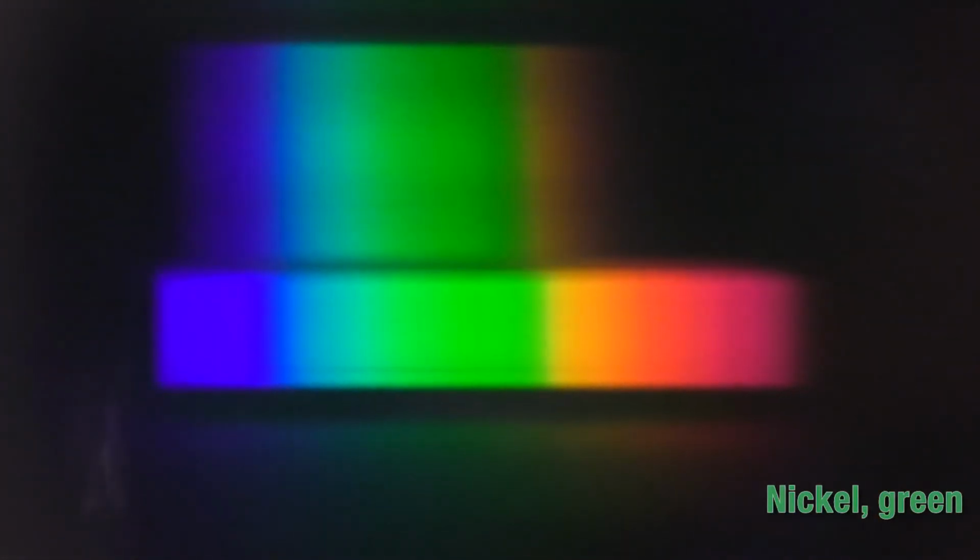All right, here comes iron, which is a yellowish orange solution. Here you can see what colors are absorbed by solutions that are that particular color. Pause the video and record that in your data sheet. The last one is a green solution made by nickel. You can see the colors, so make careful note of the colors that are absorbed.